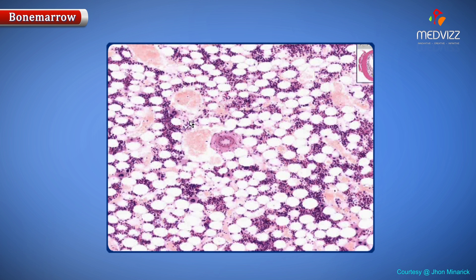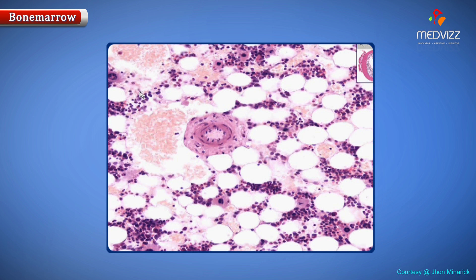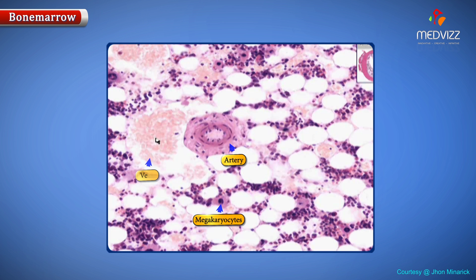And the rest of these generally circular cells, which we're not going to be able to really identify with a great amount of confidence, are going to be making your red cells and white cells, or myelopoiesis and erythropoiesis. Here's a megakaryocyte — here's one, here's one. Here's an artery. Here's a vein or venous sinusoid. Here's another venous space. And the rest of these little round critters here are adipose cells, or fat. That's it for the bone marrow cells.